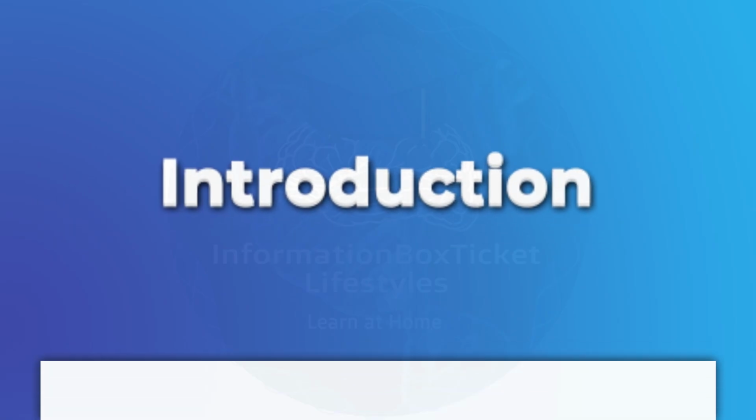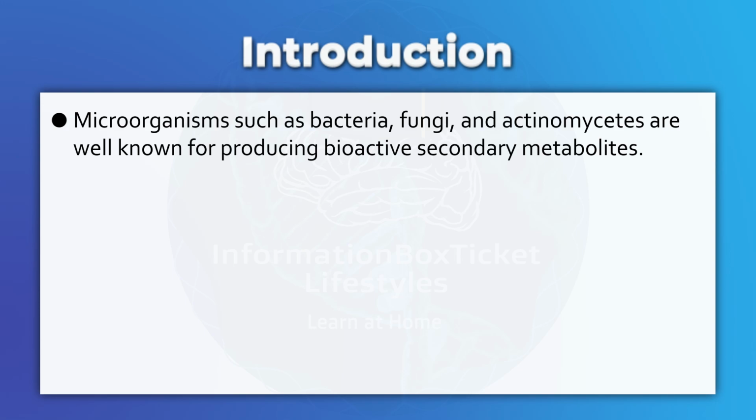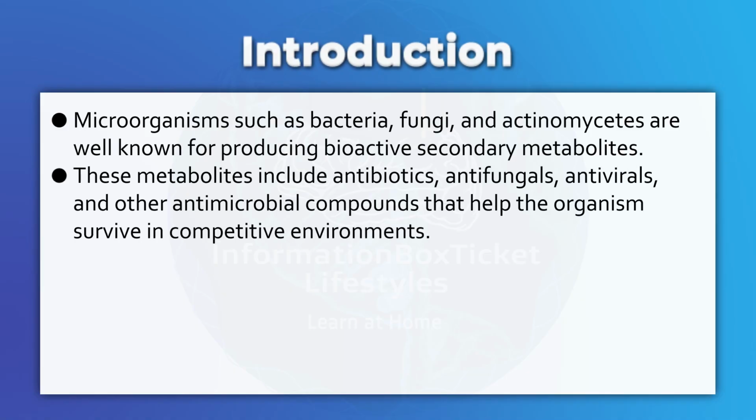Introduction. Microorganisms such as bacteria, fungi, and actinomycetes are well known for producing bioactive secondary metabolites. These metabolites include antibiotics, antifungals, antivirals, and other antimicrobial compounds that help the organism survive in competitive environments.